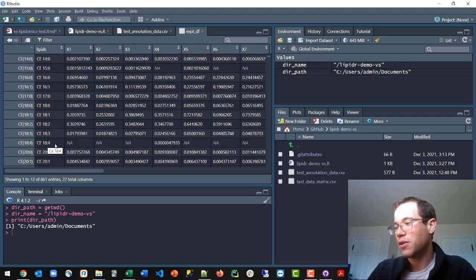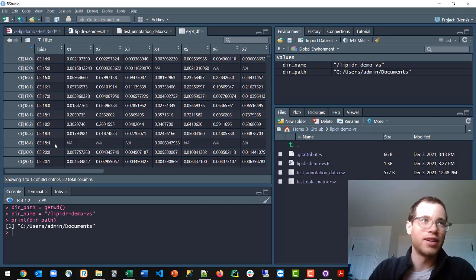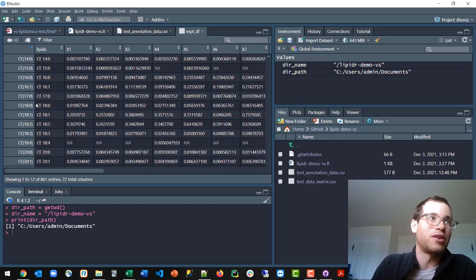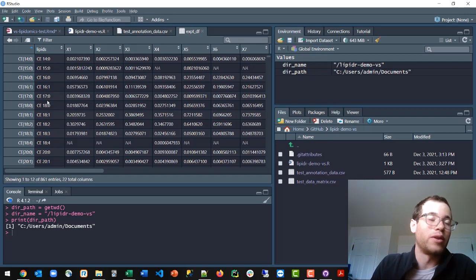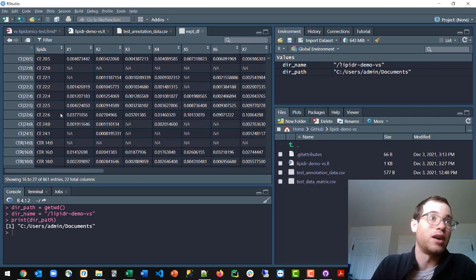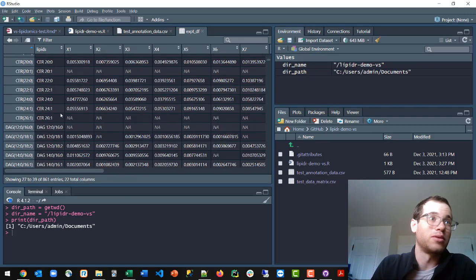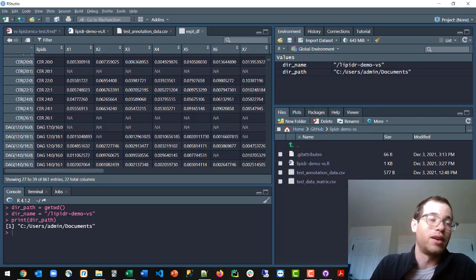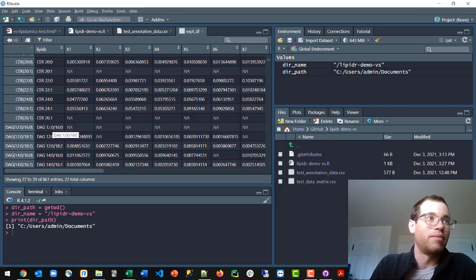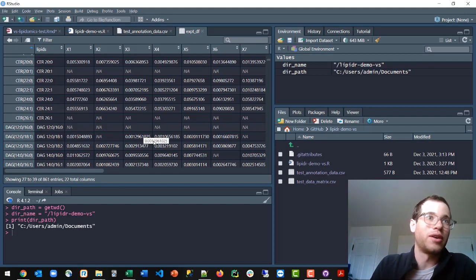Basically, it wants it in this format, where you've got the class of the lipid, followed by the total number of carbons, colon, and then the degrees of unsaturation. So this is the standard nomenclature that you're supposed to be following. And the alternative is this, too, where you've got the lipids that have two fatty acids on them, so diacylglycerides. So that's how these formats need to look.